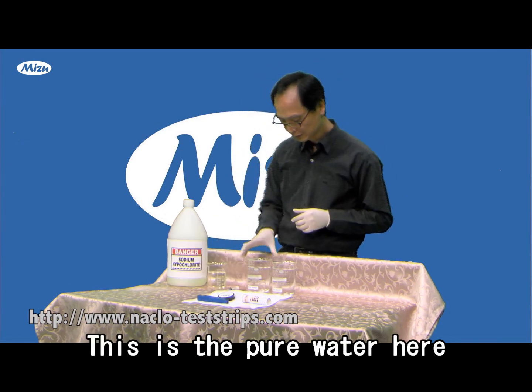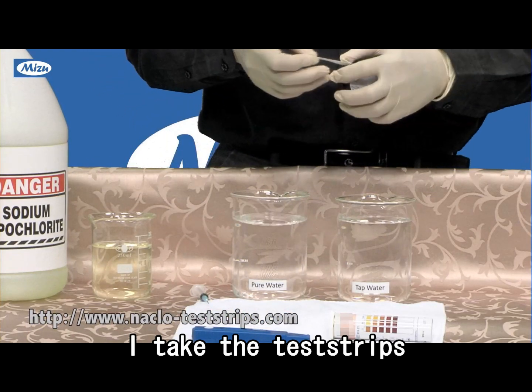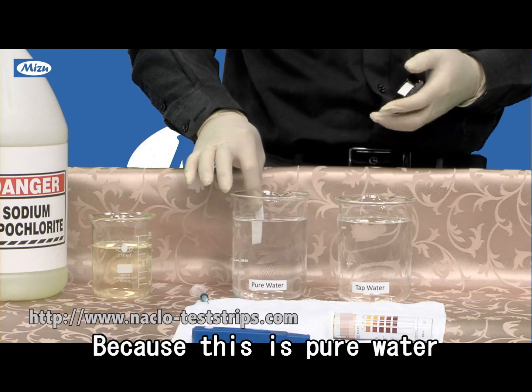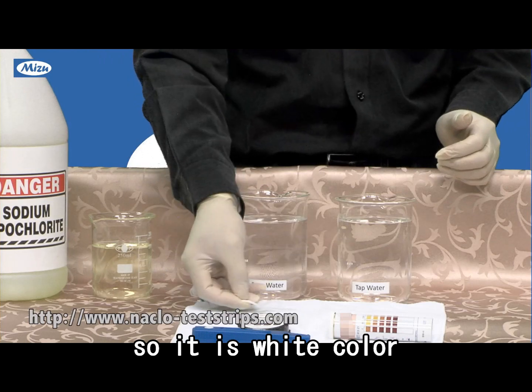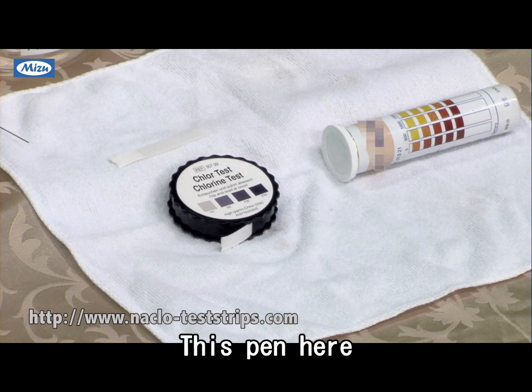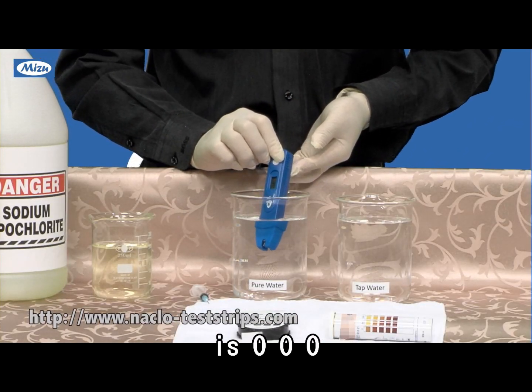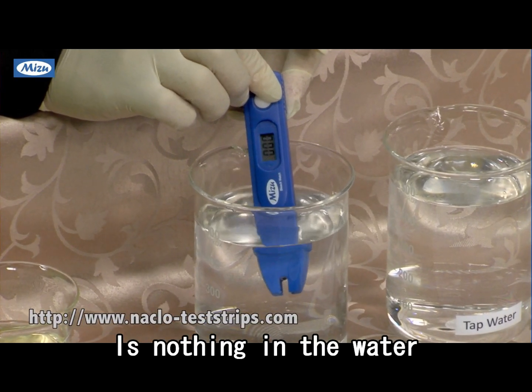So this is pure water. I take the test strip in this water, and because this is pure water, it's white color — there's nothing in the water. The same thing, this pen here reads zero, zero. There's nothing in the water.